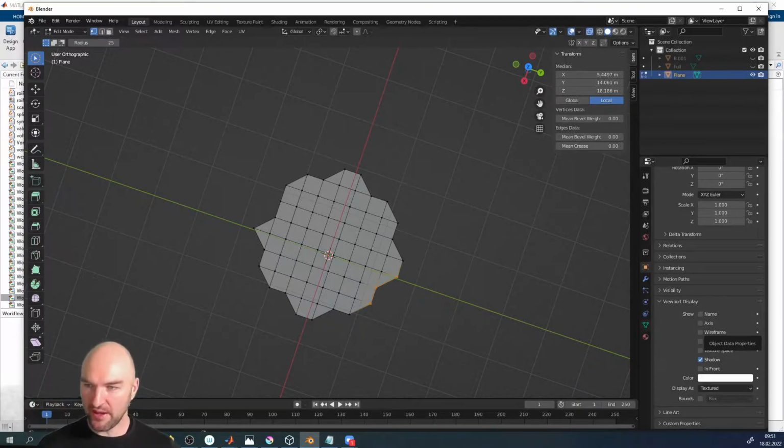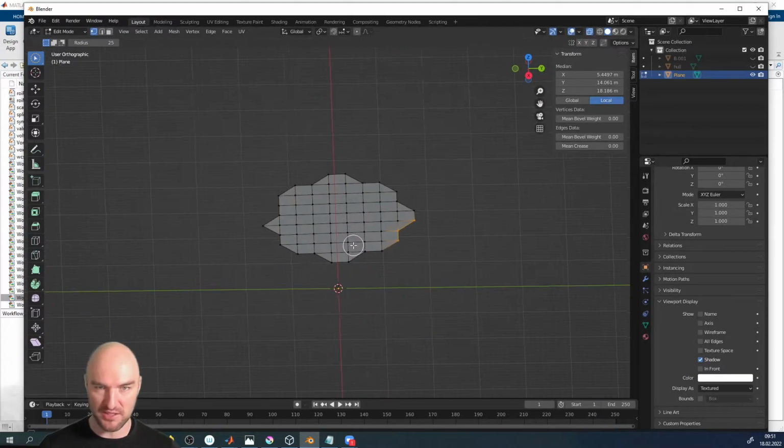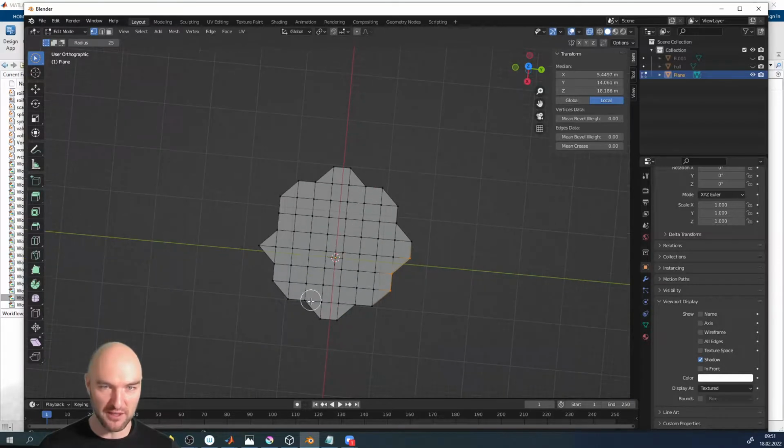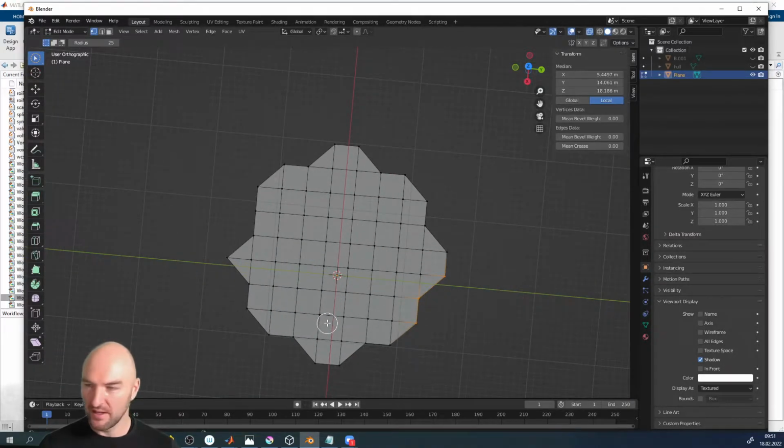One thing you have to learn the hard way is topology doesn't come for free. All of those mesh triangle relationships and so on, we can pretty much only easily create by hand. If I had an algorithm that creates mesh topology out of thin air, I would be super rich. Unfortunately, something like that doesn't exist, and it's not trivial to make. I have some papers out there with all kinds of tricks for making those meshes, but in the end it turned out that a bit of manual labor was always the most reliable and pretty much quickest way.